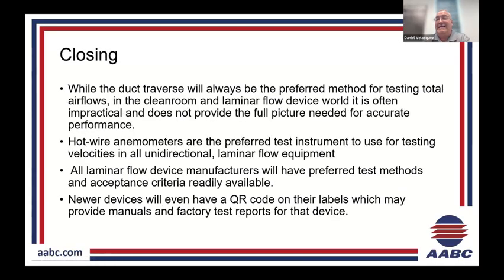One of the points that I didn't make a slide for in time that I think is critical is, when you're doing room testing like this and when you're doing laminar flow device testing like this, you want to use actual air temperatures as well. You don't want to use standard air, because a lot of times when you're reading supplies out of a HEPA filter, you're not reading 70-degree air. You might be reading 105 if it's reheating, or you might be reading 55 if it's cooling.